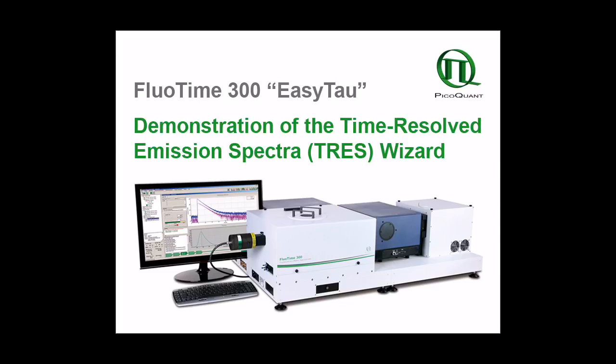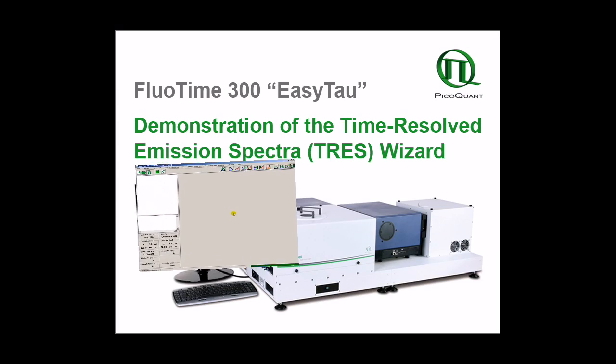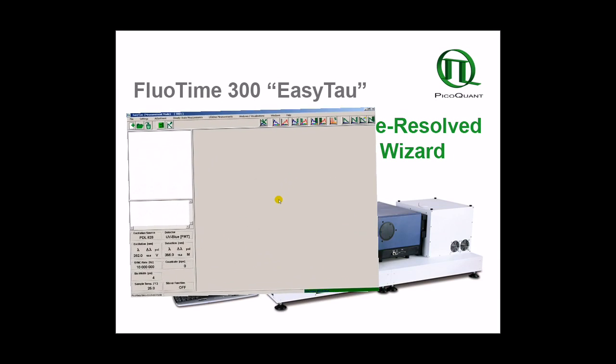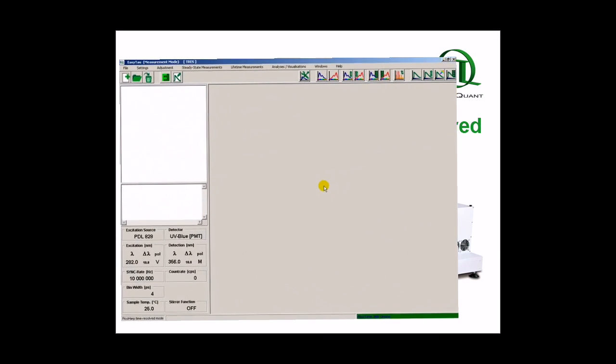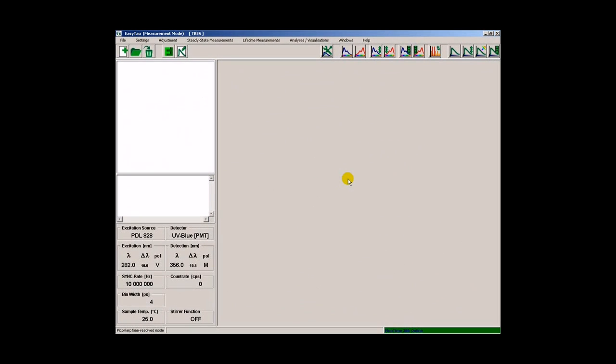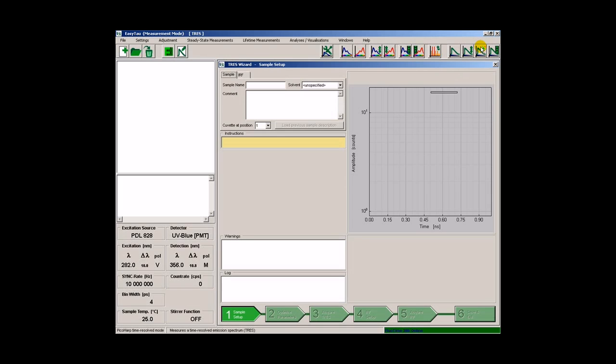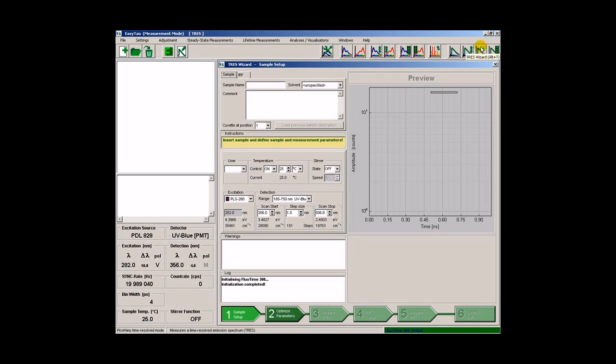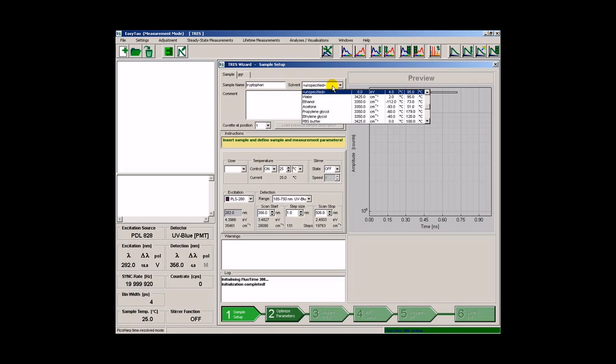In this example, we will record the time-resolved emission spectrum of tryptophan. We will start by calling the TRESS wizard. The first step is to input the sample name and select the solvent.